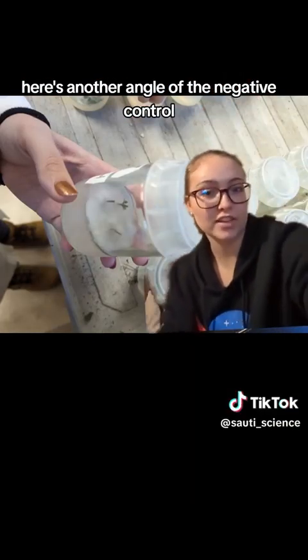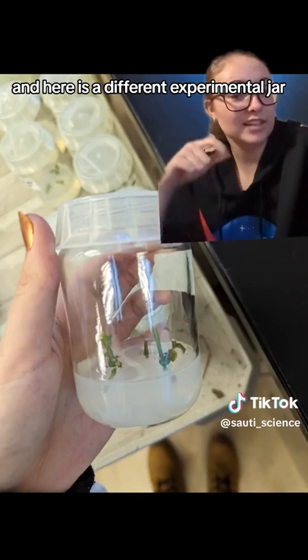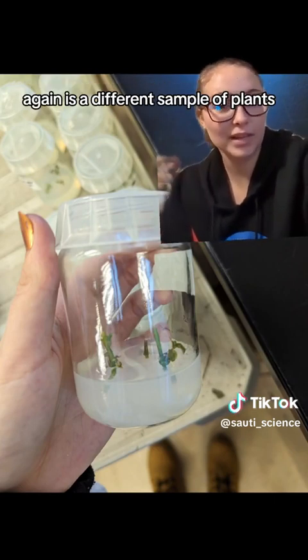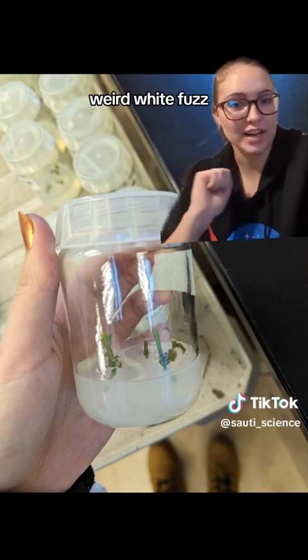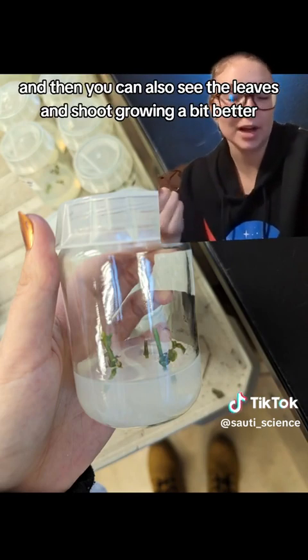Here's another angle of the negative control — you can again see it's covered in white fuzz. And here is a different experimental jar with a different sample of plants, and you can see there's no contamination because there's no weird white fuzz. You can also see the leaves and shoot growing a bit better.